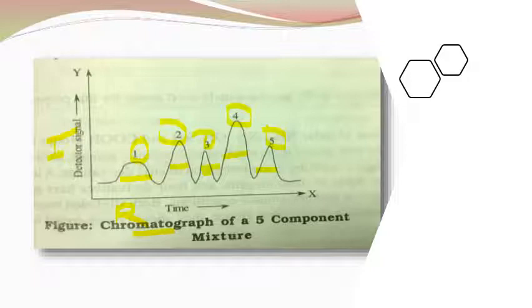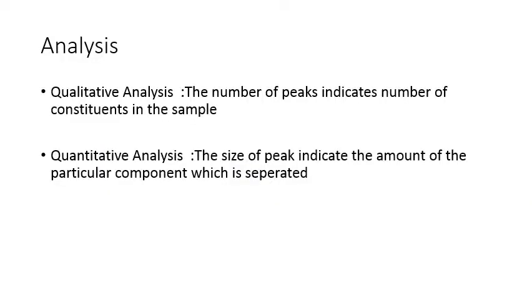The height is also different. So height with size, both give the quantitative analysis. We can do both types of analysis, qualitative and quantitative.